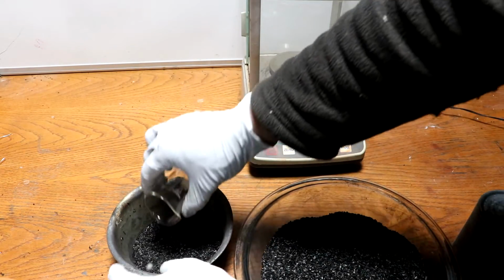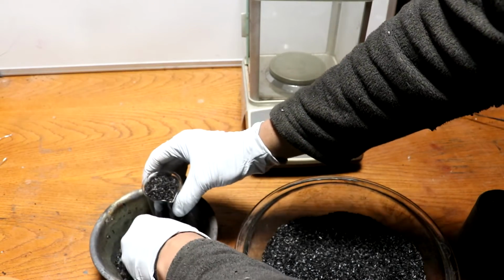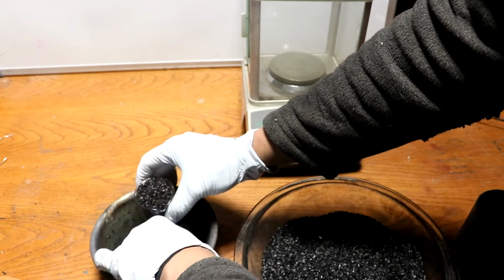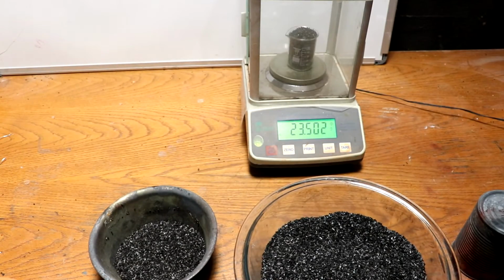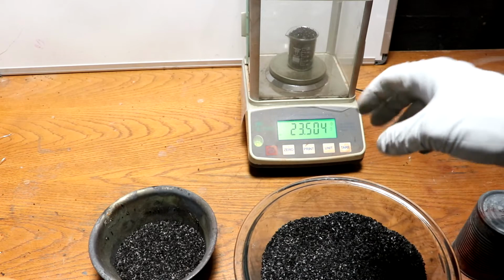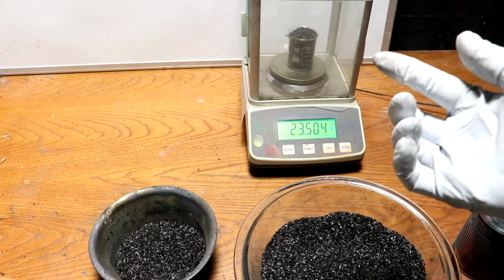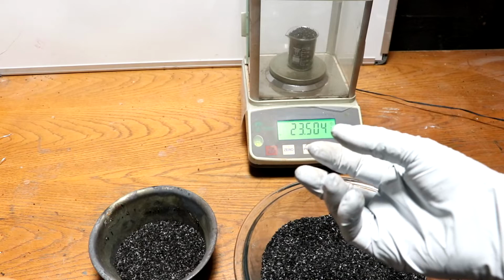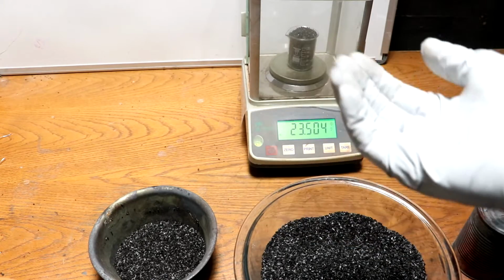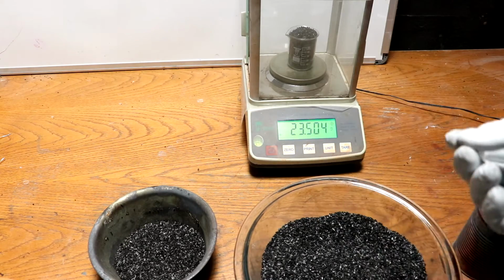Let's fill it up with the activated charcoal. Do the same thing. Okay. 23.5. It is heavier, denser. Now I would have thought that it would become less dense, but it kind of makes sense. You know, the charcoal might shrink in size, so now the packing's more efficient. And the ash didn't go anywhere. You know, there's less carbon, but the same amount of ash, and ash is quite heavy.